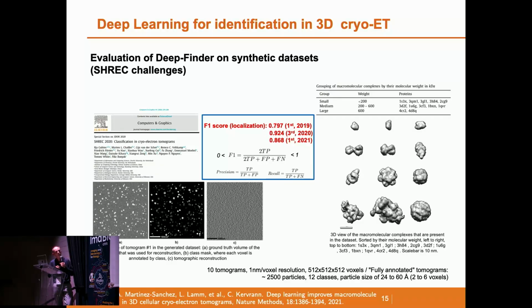And the same algorithm was ranked very well during the 3 challenges without modifying any parameter. It was a good result for us because finally, this backbone was quite robust during these three challenges.